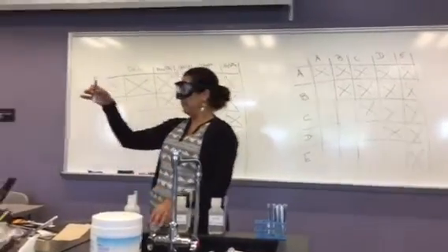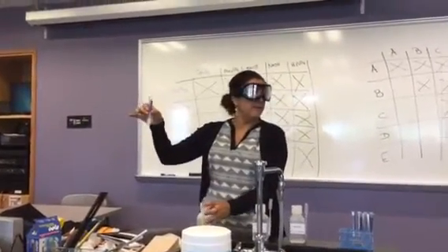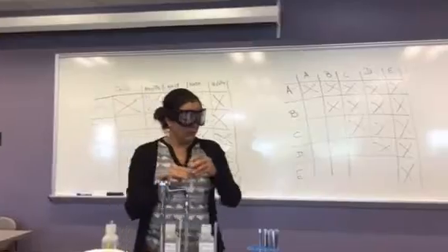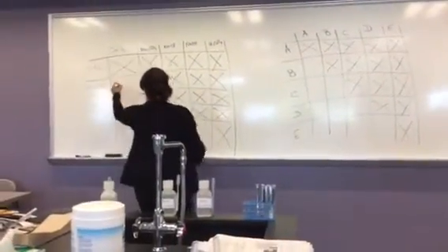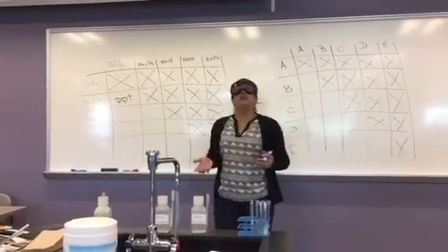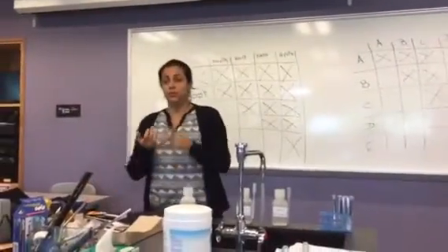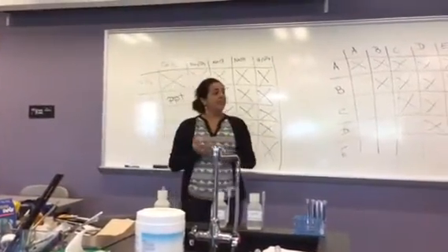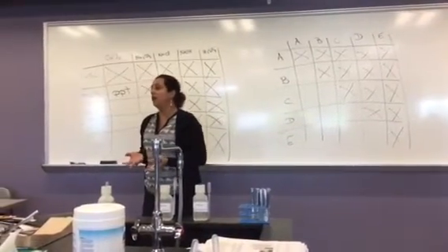What do we see? White. This white is a precipitate. So we're gonna see reactions that will occur the same like this. If it's a precipitate, we write PPT. What other things can we observe? The evolution of a gas, right? Something else that can happen, it can get hot.